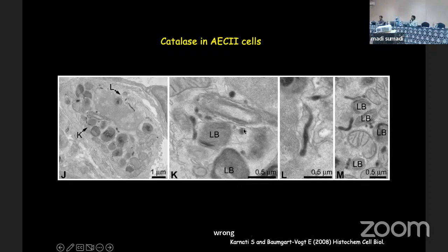For that you do not need any kind of understanding, just logical thinking. No science is required. You see very elongated ones here and then here, but you see only round here. Why? Yeah, it's a cross section. If you cut it here and you see from that point, you also see the round. So this is actually the natural way peroxisomes are in our body, in the cell.